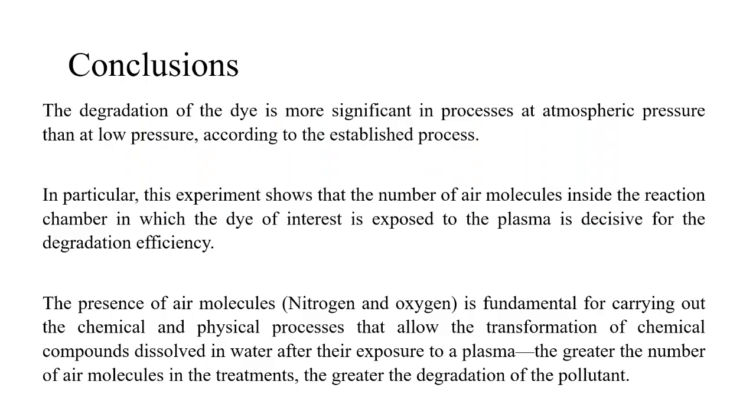In particular, this experiment shows that the number of air molecules inside the reaction chamber in which the dye of interest is exposed to the plasma is decisive for the degradation efficiency. The presence of air molecules, nitrogen and oxygen, is fundamental for carrying out the chemical and physical processes that allow the transformation of chemical compounds dissolved in water after their exposure to a plasma. The greater the number of air molecules in the treatments, the greater the degradation of the pollutant.